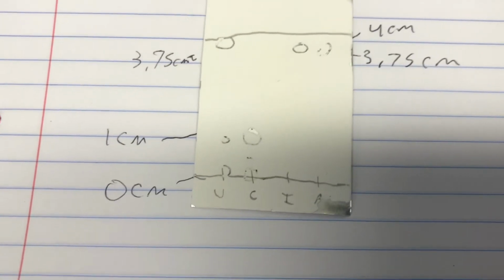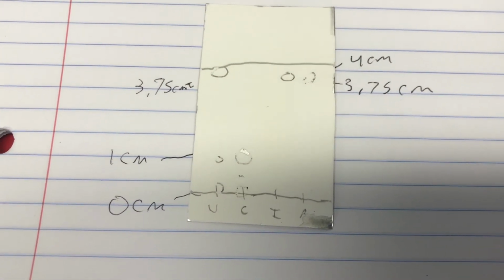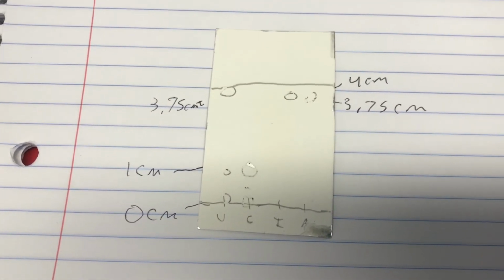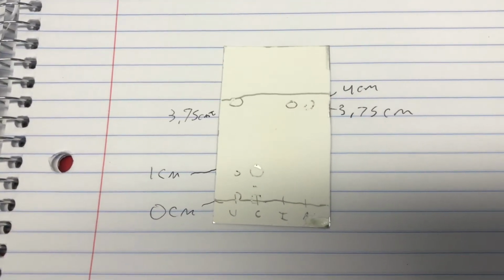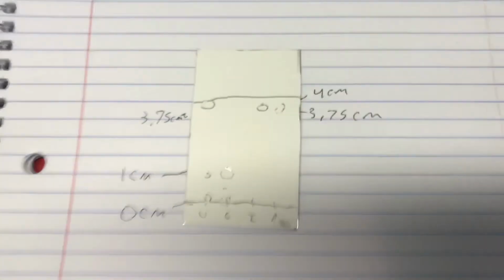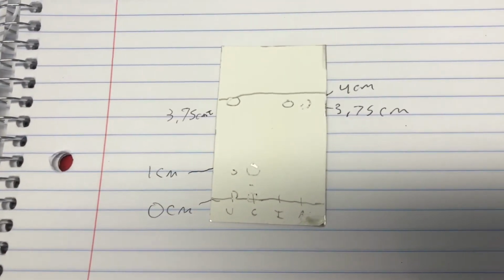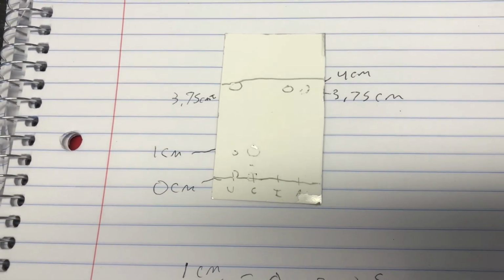So you can say pretty certainly that it does have the caffeine in it, and it has either the aspirin or the ibuprofen. The unknown actually ended up being caffeine and aspirin. So as you can see, it is actually consistent with that. Unfortunately, the fact that the ibuprofen's at about the same height stops you from being able to definitively say whether that's the case or not.